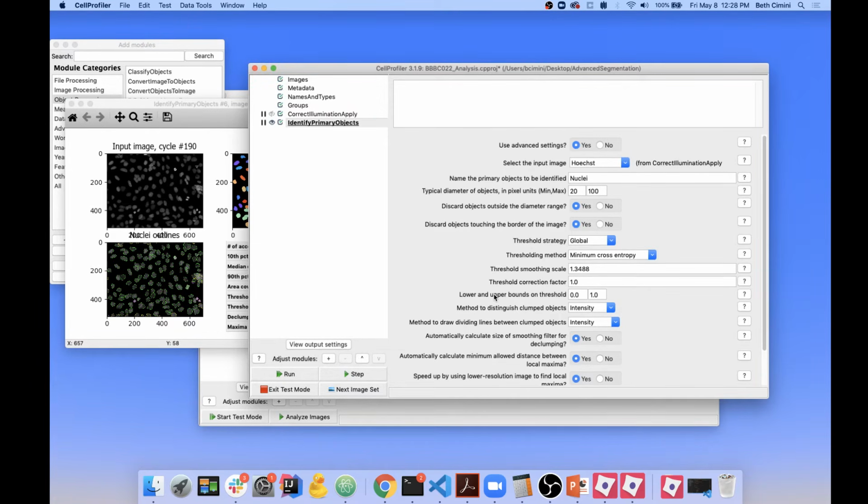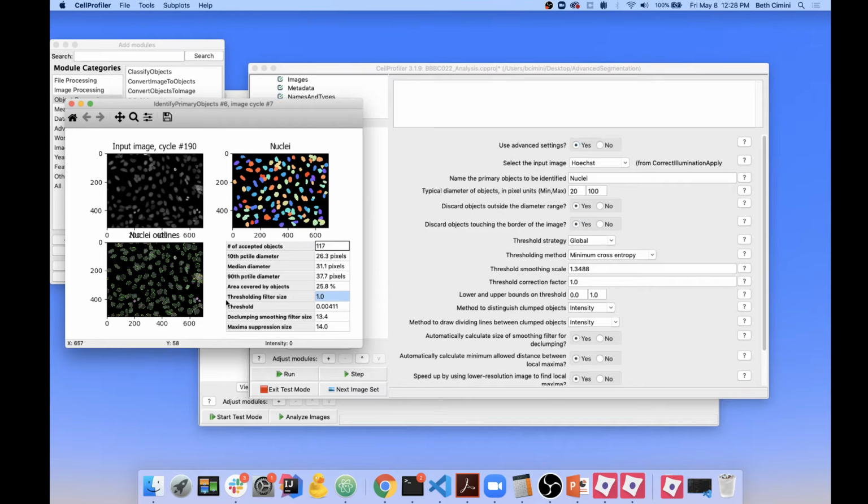The first several settings that you see should look really familiar because they're the settings of the threshold module, and in fact they are exactly the same as the settings in the threshold module, with the exception that this image now gets smoothed a little bit before we draw the boundaries. This just typically helps with making nice smooth outlines of objects.